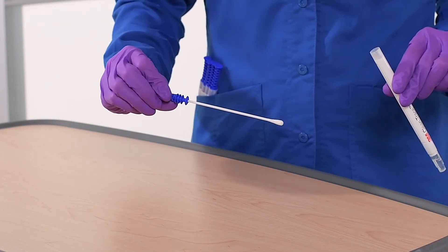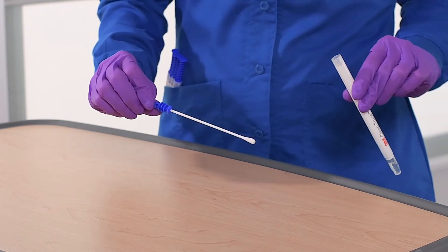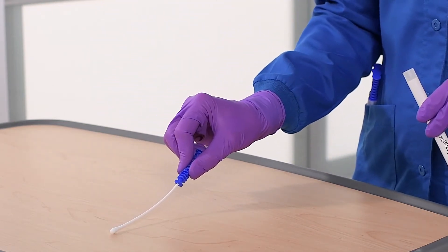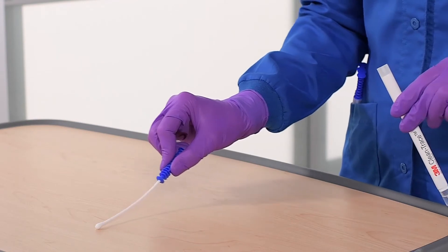Hold the test between thumb and forefinger so you can easily rotate the swab. Touch the swab to the surface you are testing and apply enough pressure to cause the wand to flex.